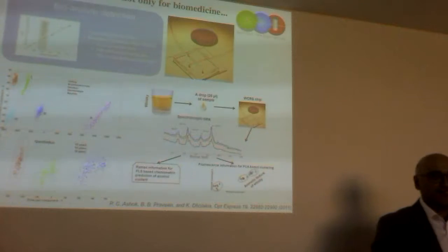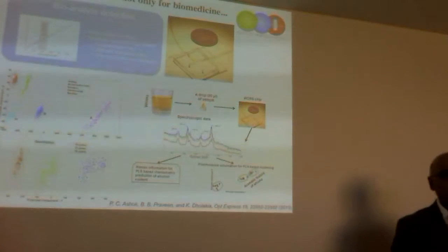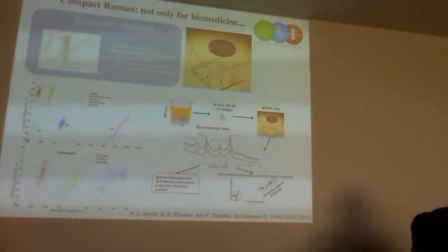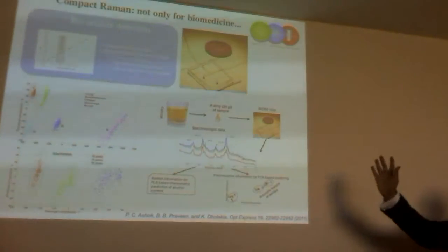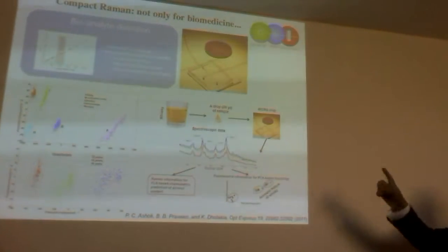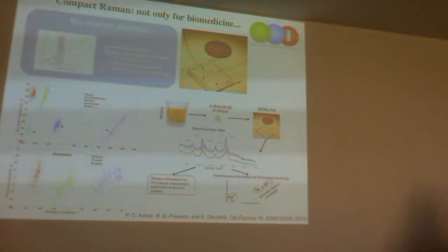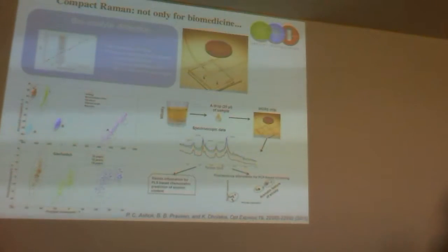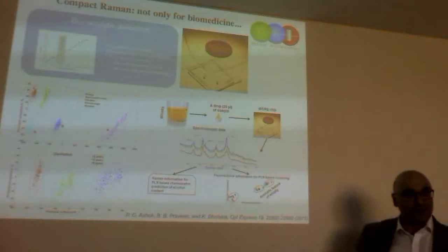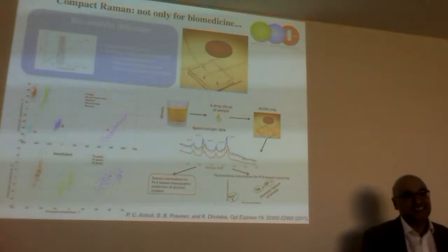So does your channel itself act as your waveguide then? Yeah. So we just mill a 100 micron channel. You can do what you like. This is just one we've used, and it was one we used for blood testing that we use for whiskey. We don't actually use that device. I can show you. We have a little complete handheld device now for that kind of stuff. But for bodily fluids and, you know, in the biomedical industry, you want to use the minimum amount of analyte, obviously. So that's why we developed it.